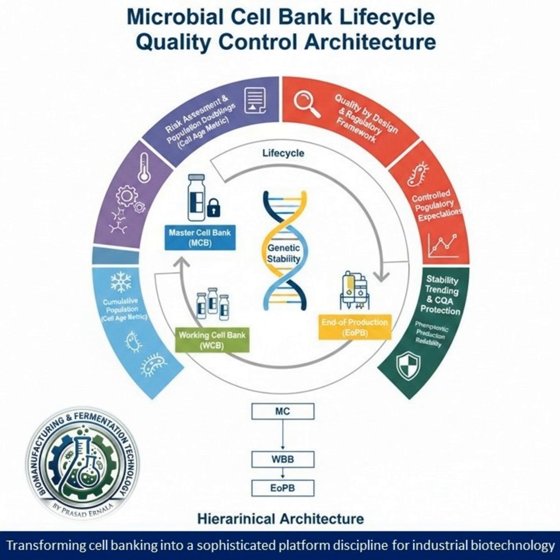Sure. For a strain that's constitutively expressing a protein, so it's always on, we typically use growth-optimized conditions. Moderate temperature, high oxygen, whatever keeps the cells in a robust, healthy log phase state. And what if it's an inducible system where you add a chemical trigger later on? In that case, you almost always avoid induction during bank manufacture. The goal is to prevent selecting for subpopulations that are maybe stress-tolerant but have altered expression. You apply the stress of induction only later, in the controlled environment of the big bioreactor. You bank the naive, pristine version of the cell.